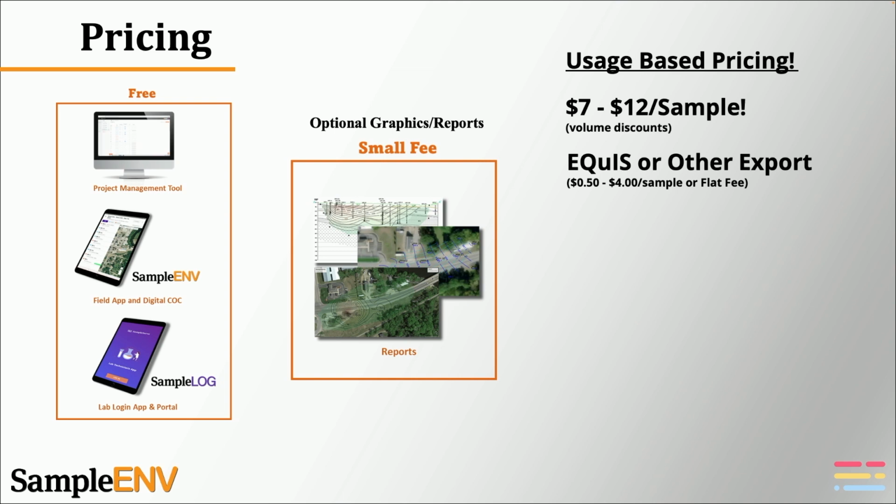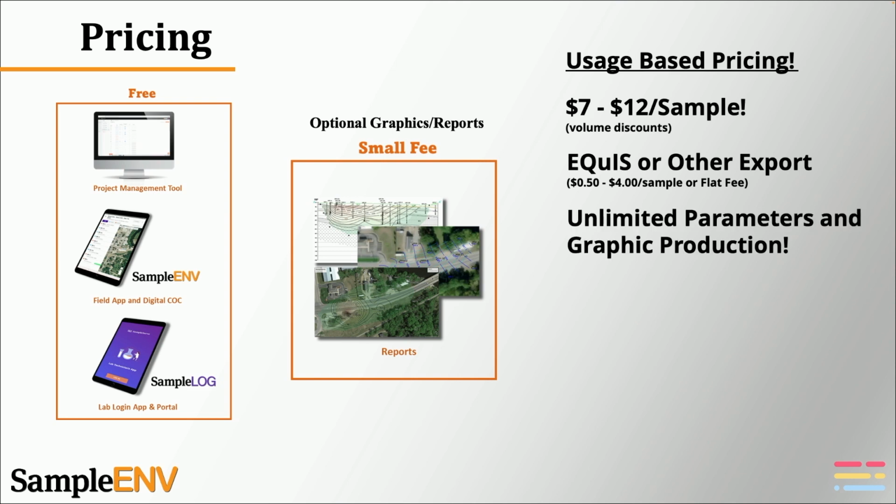If you've opted into the reporting features, you are allowed reporting on unlimited analytical parameters and allowed unlimited graphics generation. You can run as many graphics and as many types of graphics as desired. There's no limit on these services.